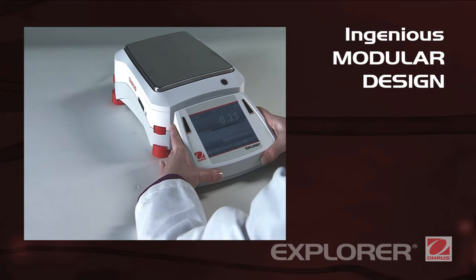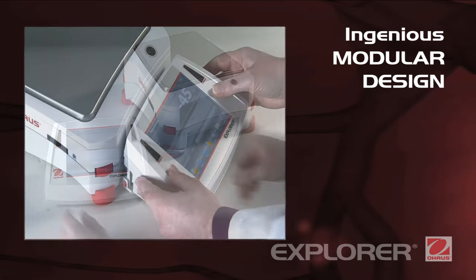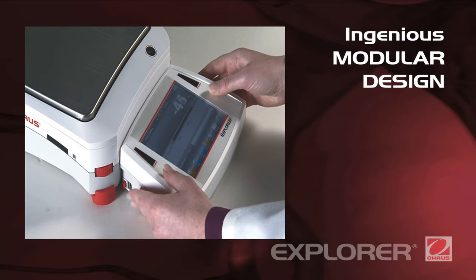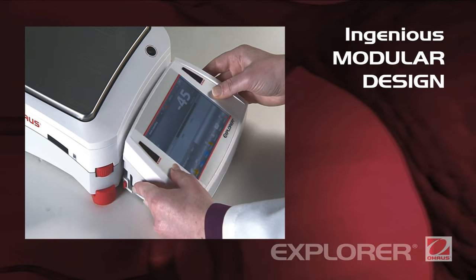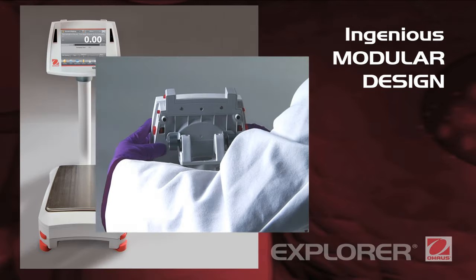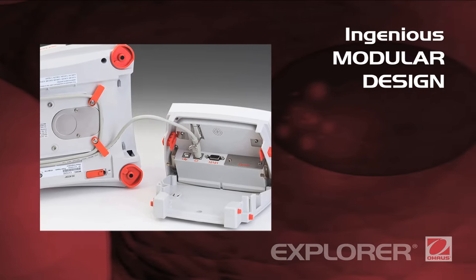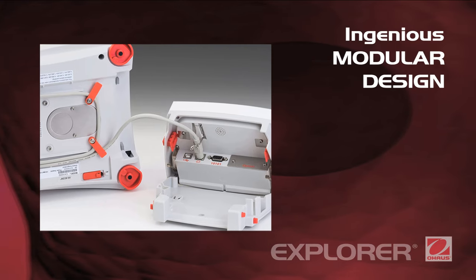Ingenious modular design. Explorer's modular design features a color touch display that can be separated from the weighing base. The display can be adjusted for optimal viewing, mounted on the wall, or on its optional tower accessory. A robust die-cast metal base features an integrated cable storage system.